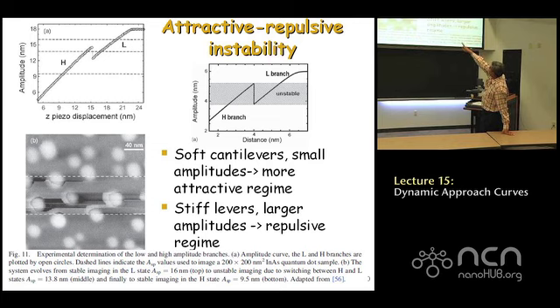That's the image taken on the very top, right? Topography image, and you see that throughout the scan image, it stayed in the net attractive regime, okay? And you know that because you've done the phase diagram and you know that that amplitude corresponds to attractive regime. So the top third of this image is taken in this attractive state. And the state did not switch during operation.